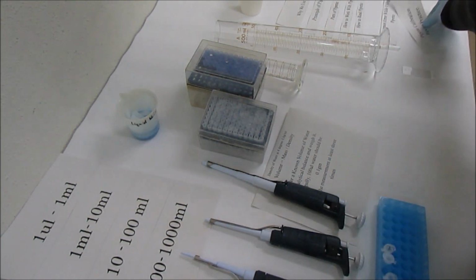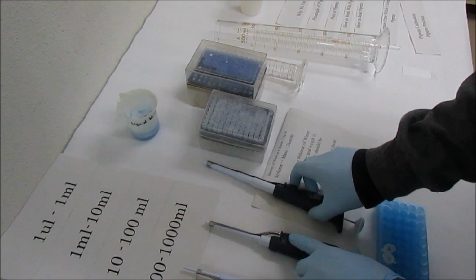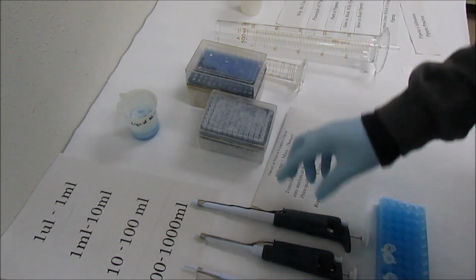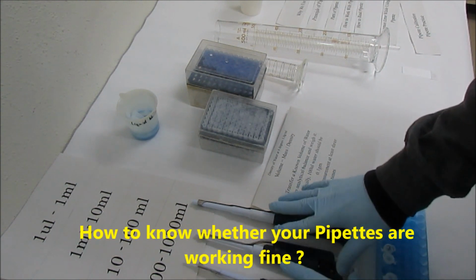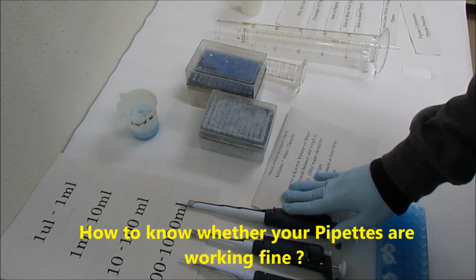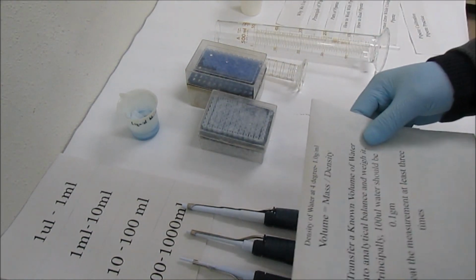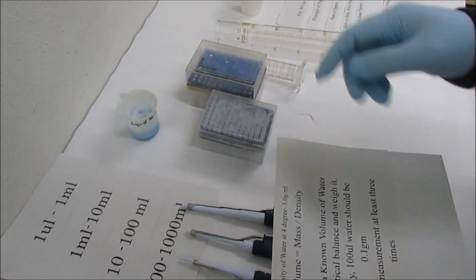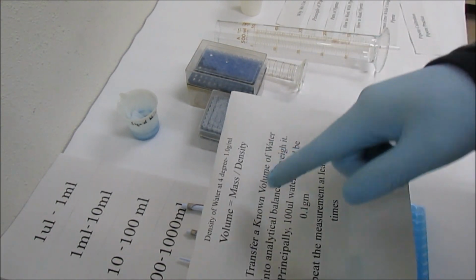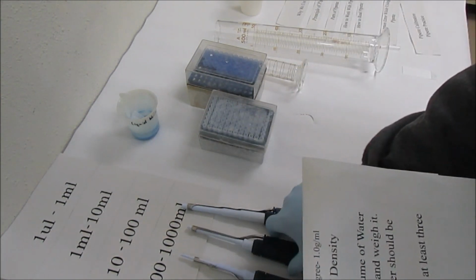Now the most important thing: suppose you go to the laboratory for the first time and your supervisor gives you a set of pipettes. Your first job is to confirm whether your pipette is working fine or not. So how can you calibrate a pipette? This is a very important step, but very easy to do. You know the density of water is about 1 gram per ml.